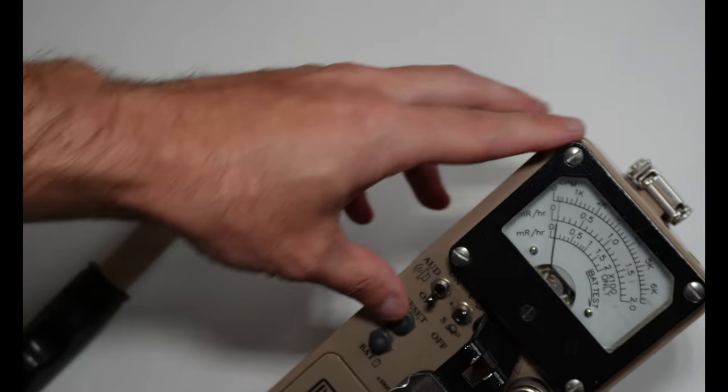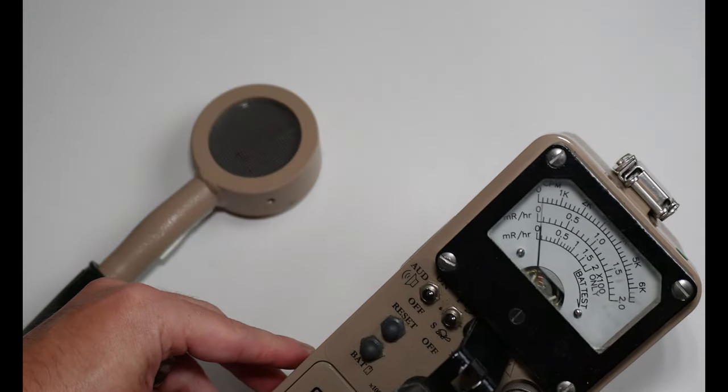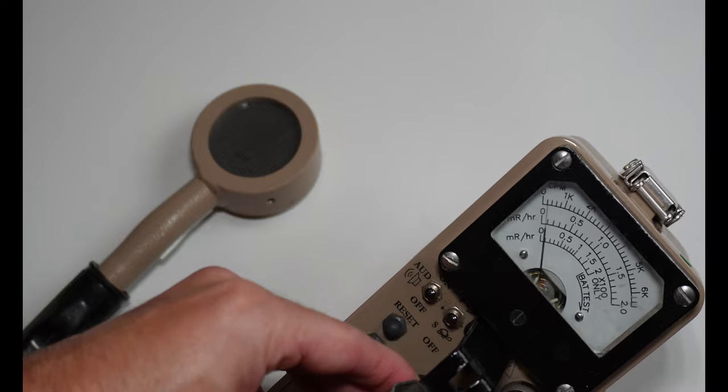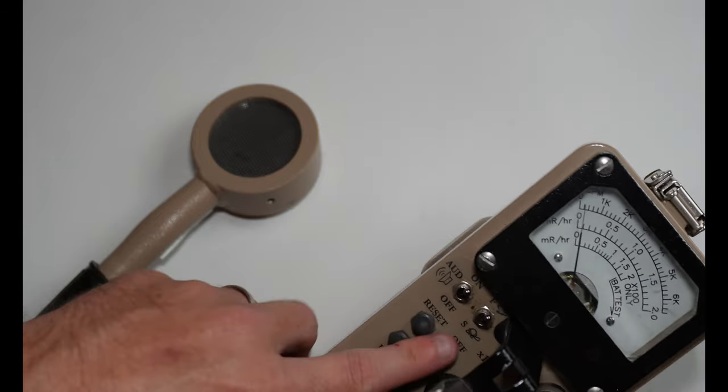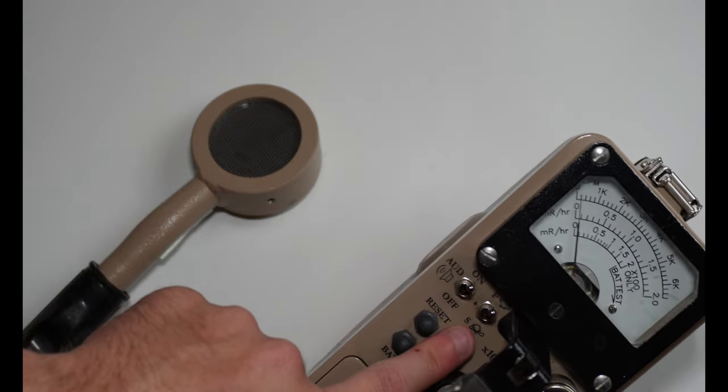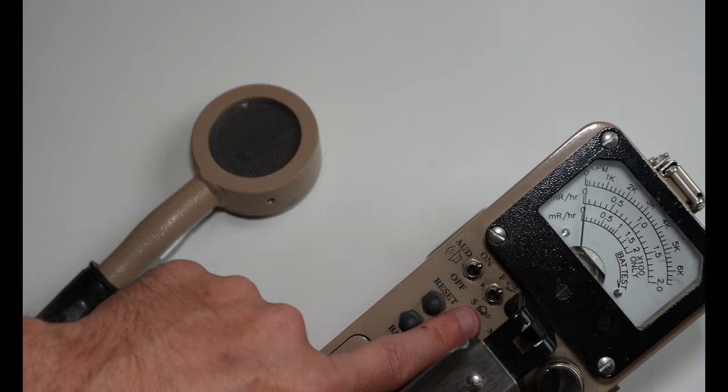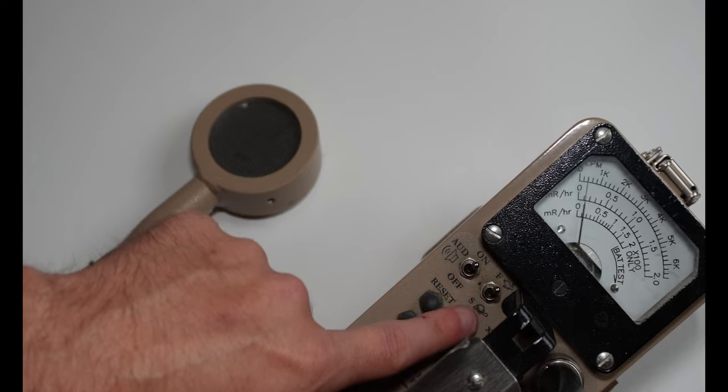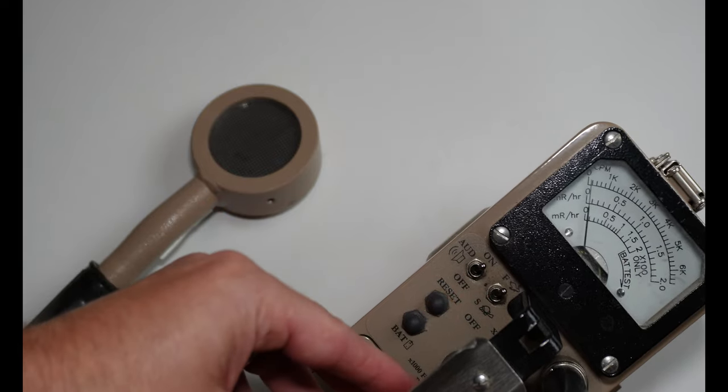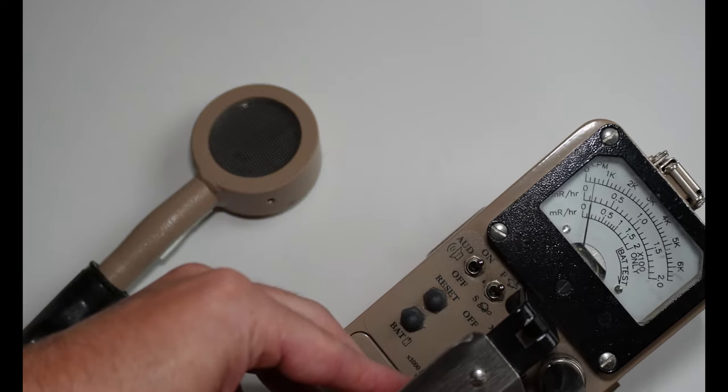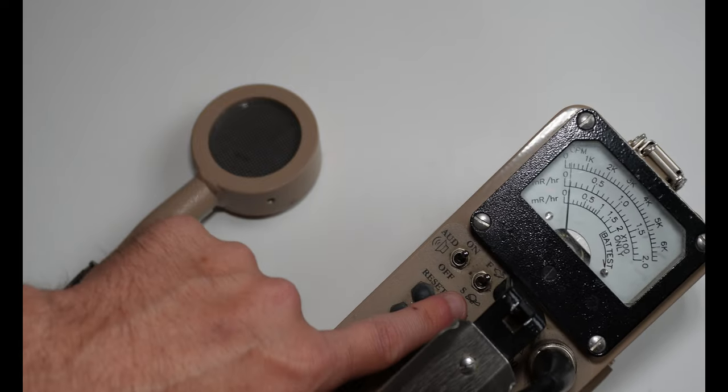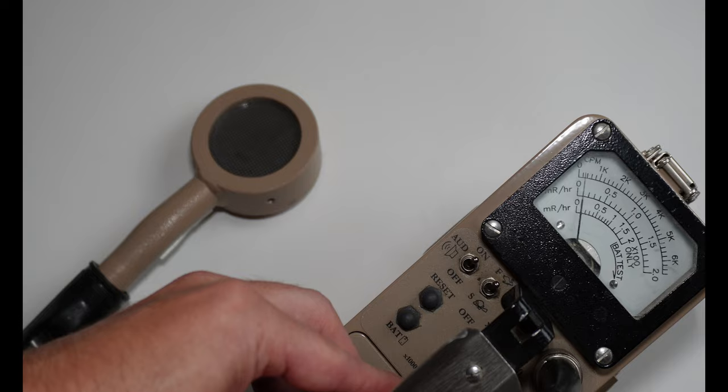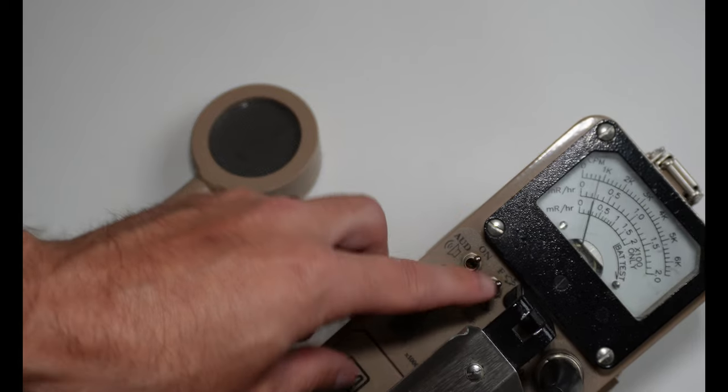We can also flip the audio on, so that we can hear the audible clicks of a radiation. You also have a F and S setting, or a fast and slow setting. Currently we're set on fast. That's a very good setting for looking for removable contamination, or any kind of contamination. The slow setting is going to be good for making a direct measurement of the check source.